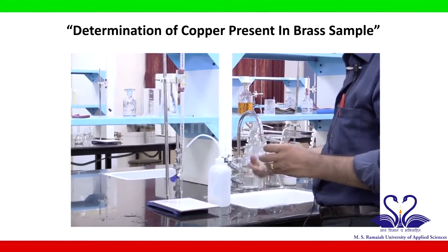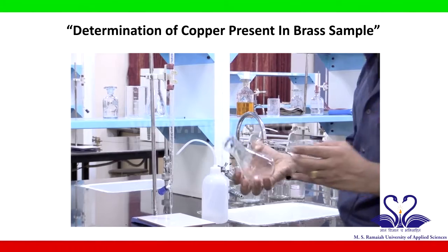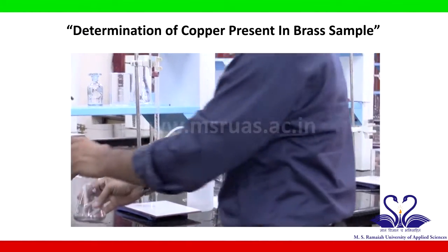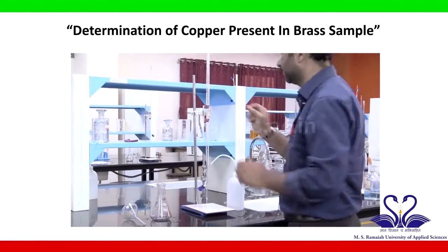Dried, because your nitric acid should not be diluted. So you have to try to remove as much water as possible. This has to be taken for the experiment.